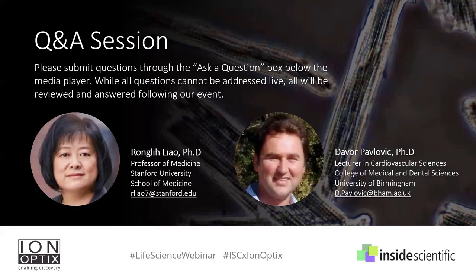these cells de-differentiate, and after 16, 17 days, they really look unrecognizable. They start developing filopodia and start even getting some automaticity back. So this is more of a fun experiment rather than an experiment that I would recommend. So culture conditions of 1 to 3 days using M199 media, perfectly fine.